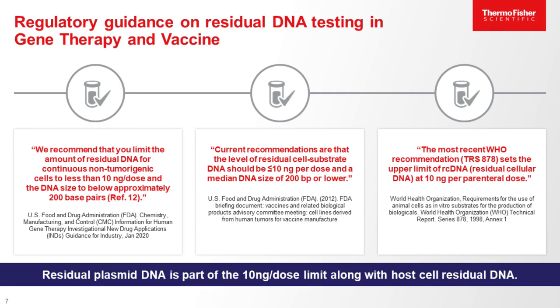Similar recommendation can be found in the US FDA 2012 guidance. The most recent WHO recommendation also sets the upper limit of residual DNA at 10 nanogram per parenteral dose. Residual plasmid DNA is a part of the 10 nanogram per dose limit along with host cell residual DNA.